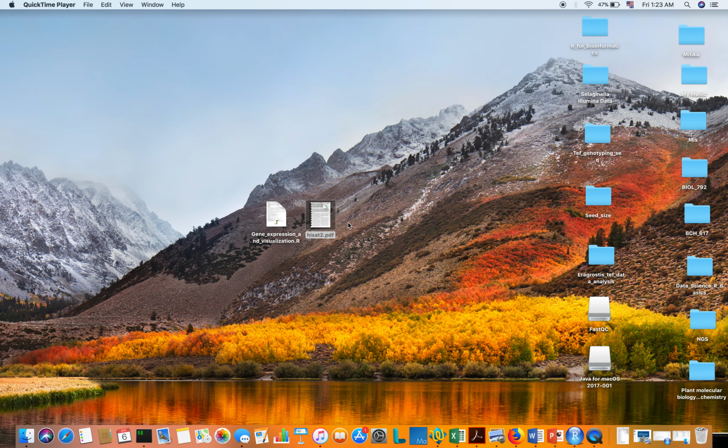Hello, I am Mitiku and I am making this video for assignment number 3 of the HiSat tutorial. This particular assignment is on differential expression analysis. Essentially, the assignment has two subcomponents: the differential expression analysis and data visualization, or visualizing the output from the differential analysis.